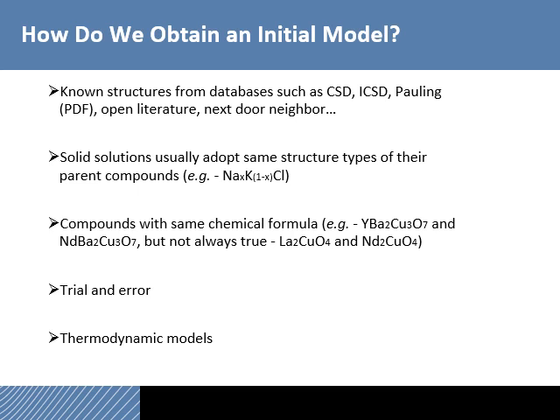Obviously, you can do trial and error in terms of models. For most of you, that's not going to work. And then you can obtain an initial model from thermodynamic models.